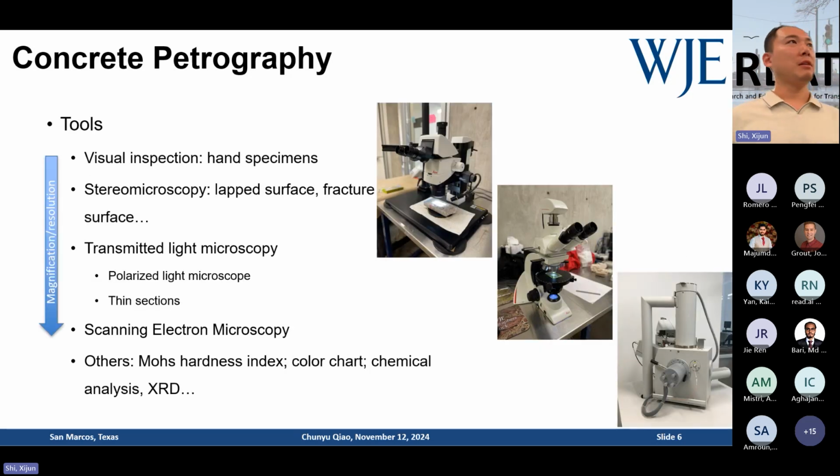First tools we're talking about for petrographers are our eyes. So we have to be very sensitive to the different features or subtle characteristics in samples for different projects. That we call the beginning of the examination, from when we receive the samples. After we have the first round of login or receiving the sample and inspecting it visually, we will ask the technician in the lab to prepare samples in different ways or unique ways we want to examine.